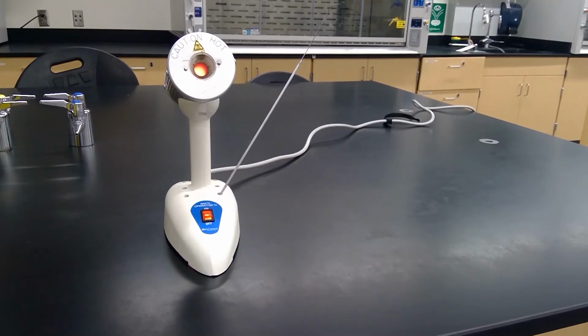Alright, so now we're ready to start the procedure for selective and differential media. You will inoculate plates of MSA, PEA, and MAC with your unknown, a positive control, and a negative control.